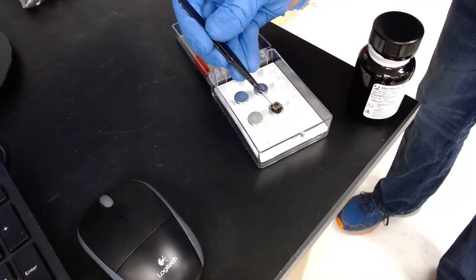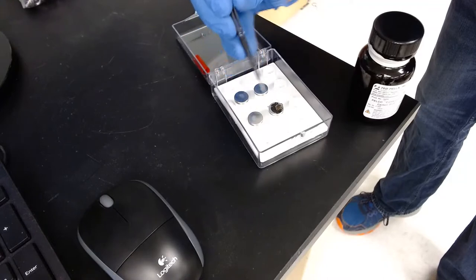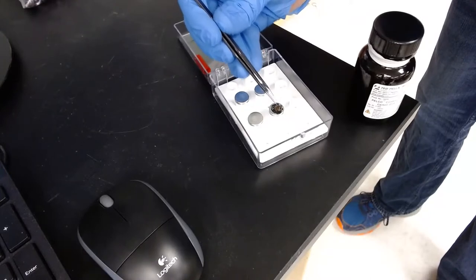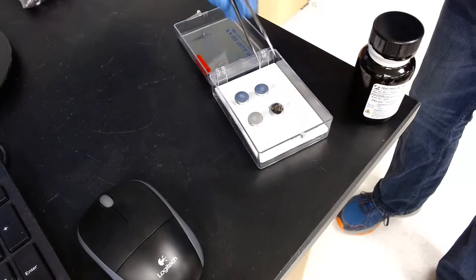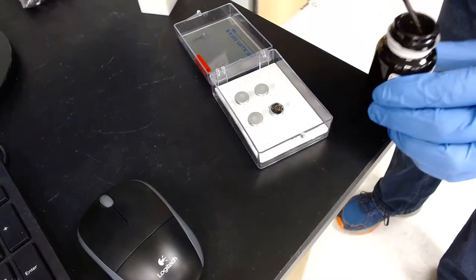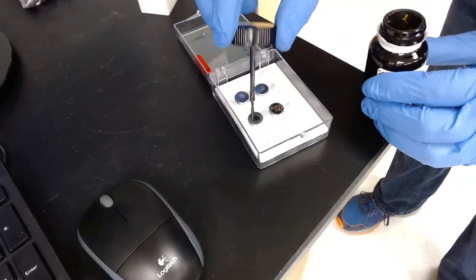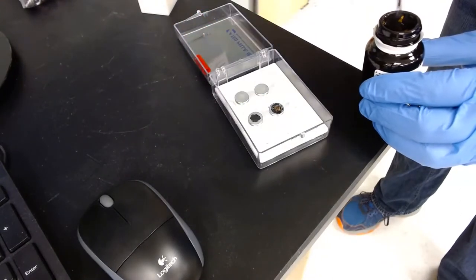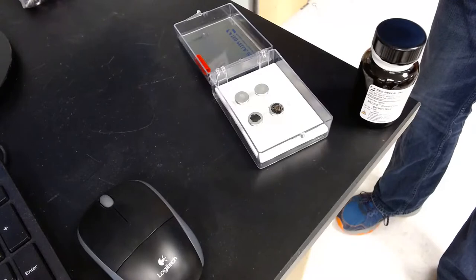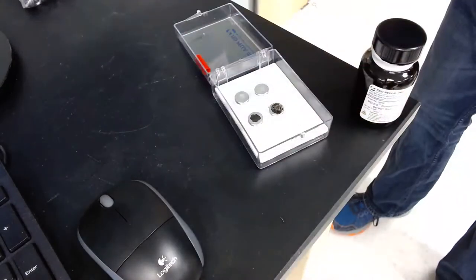Hey, look at that. Now, little spider there. We don't want to lose that leg. So what we're going to do is use this carbon glue to adhere our samples to it. And then I'm going to take this over to the sputtering system, which is a plasma system, and cover them in a thin coat of metal. Now, just in case that spider as a whole is too big for good viewing, we're going to get one that just has a couple legs. Can you guys see that leg? No, do the thing where you put your hand behind it. Oops, I dropped it. Oh, God.